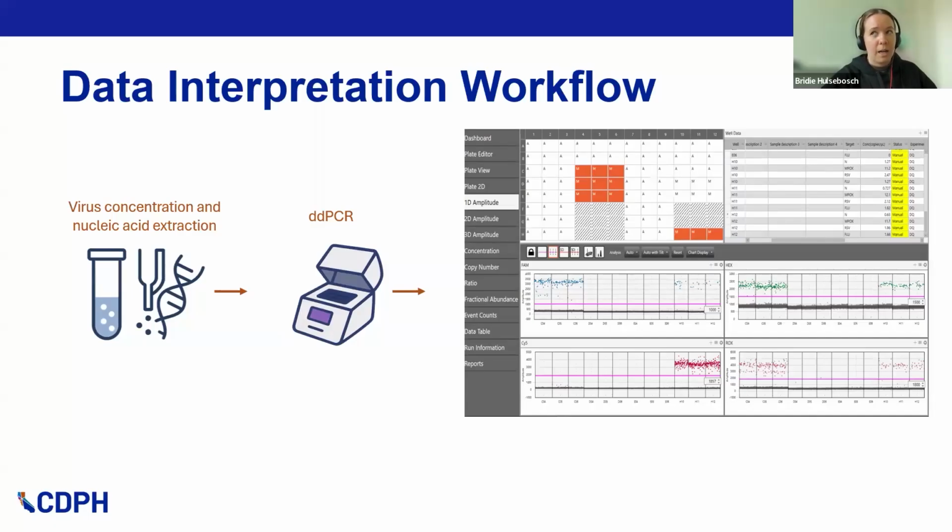We have nine different targets we are analyzing for, including controls, which includes SARS-CoV-2, RSV, flu, and then of course we have H5N1 and multiple Mpox clades that we are analyzing for. Then we have control viruses that we look for as a way to measure population and also to measure if we had a contamination during one of our workflows, whether it was during concentration or extraction.